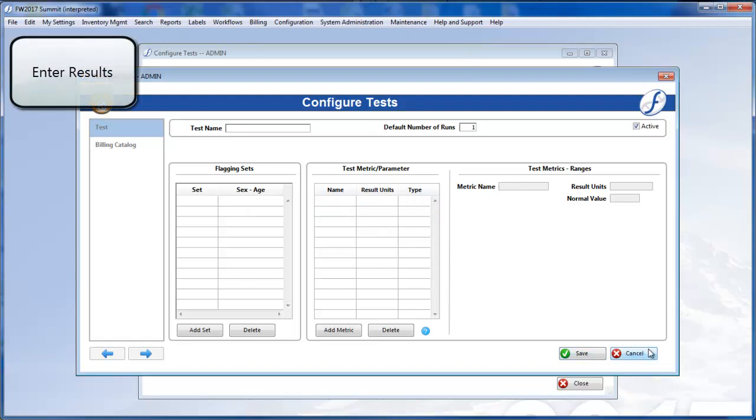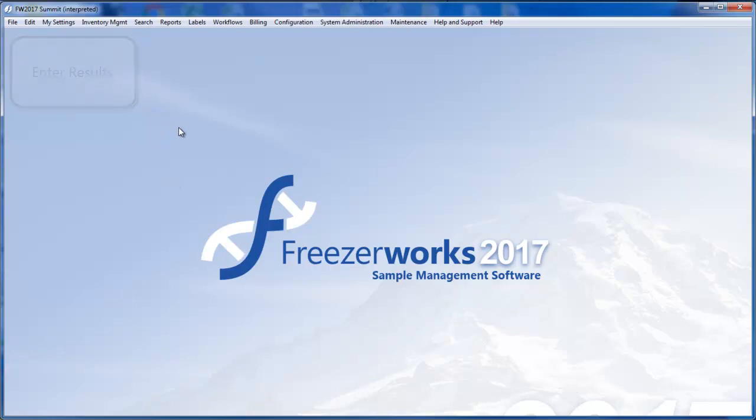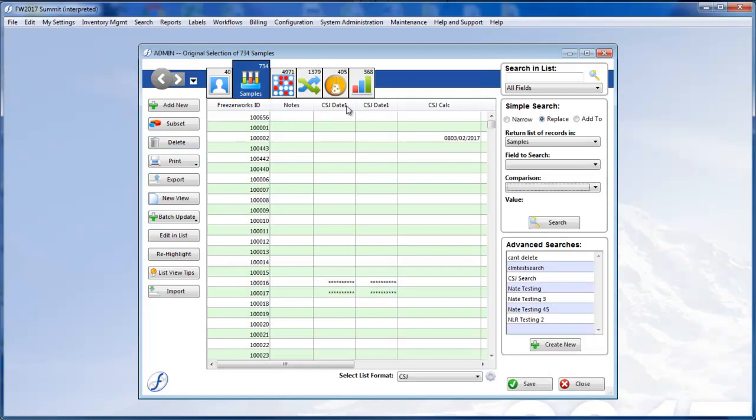This new way of configuring tests will, of course, impact the way you enter results. You will now input quantitative and qualitative results for the same test, and thus in the same window.